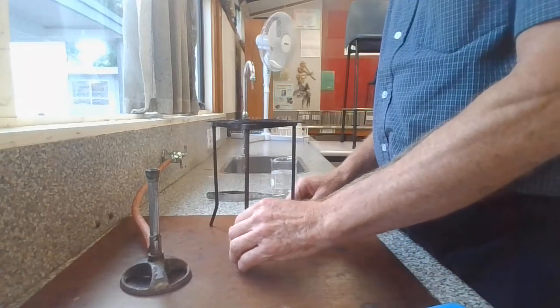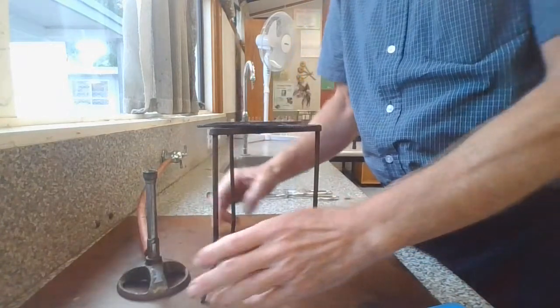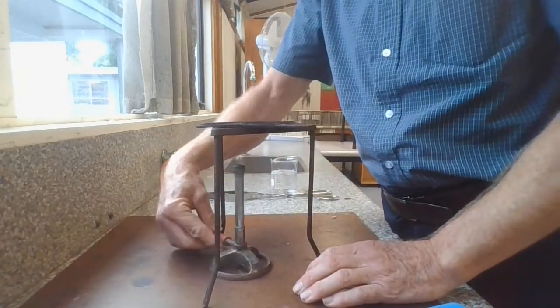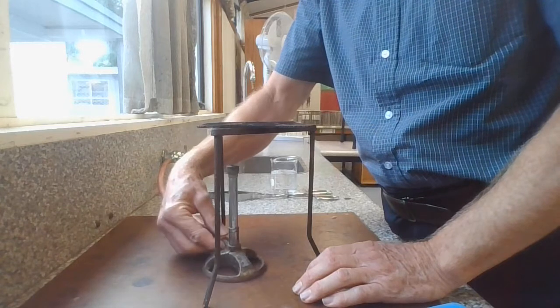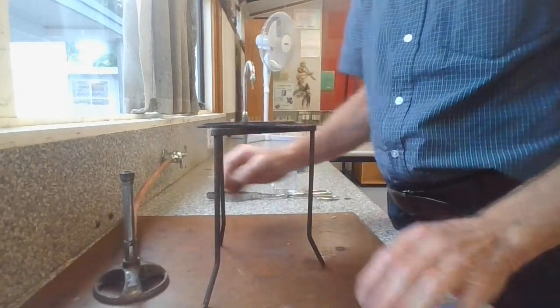First thing before you light the Bunsen is to ensure that the Bunsen and the tripod are positioned so that the Bunsen can be moved in and out from under the tripod nice and comfortably.